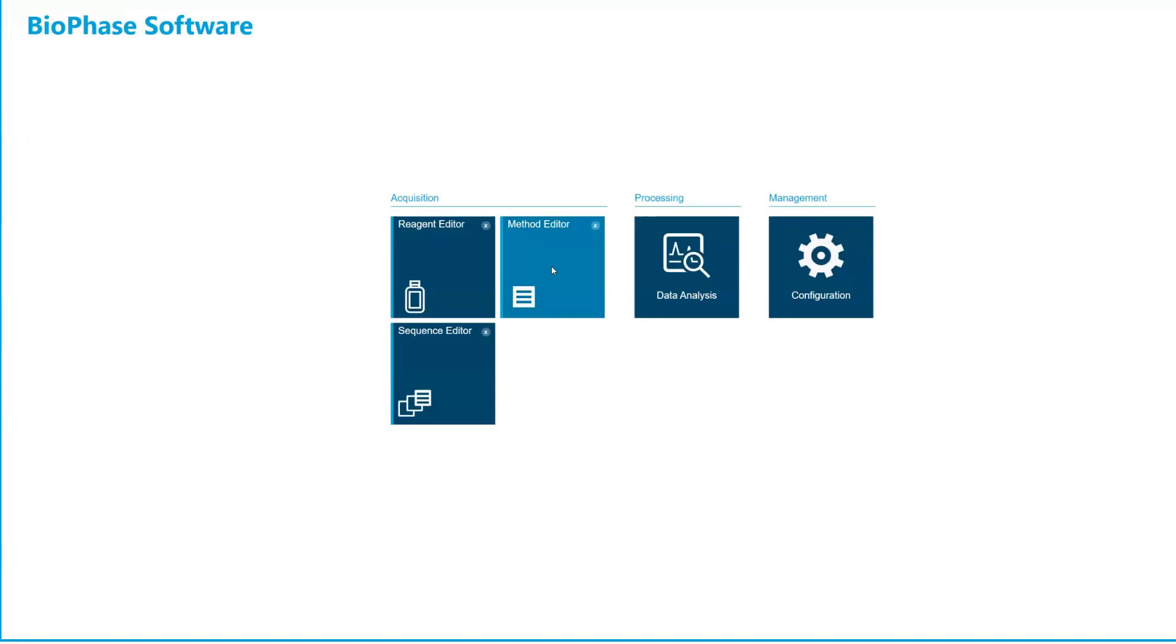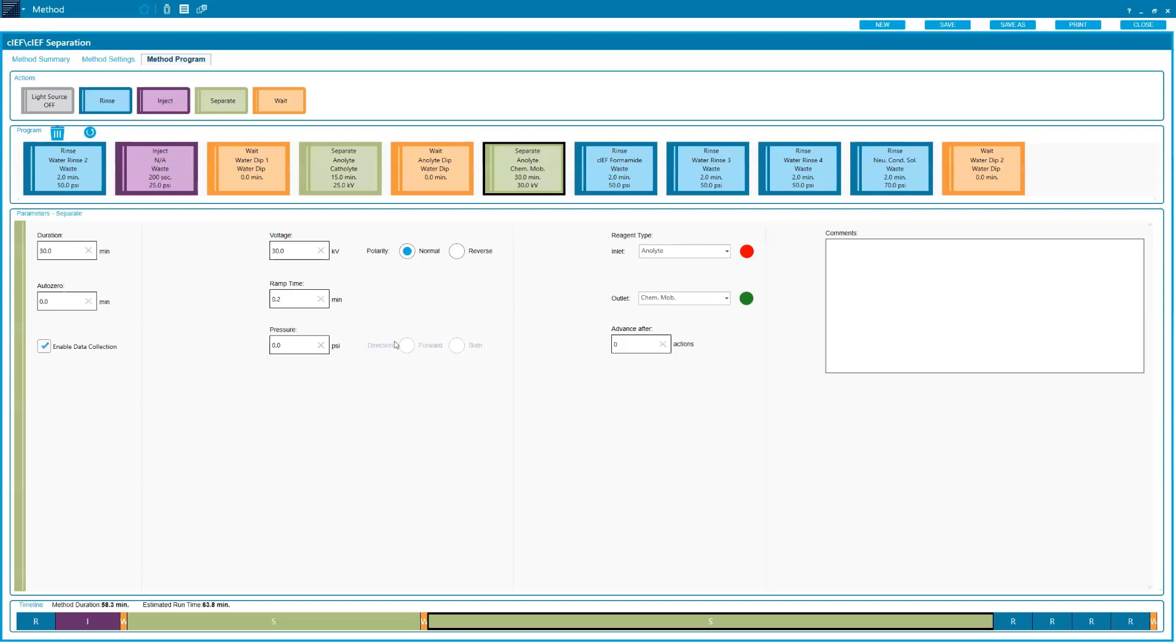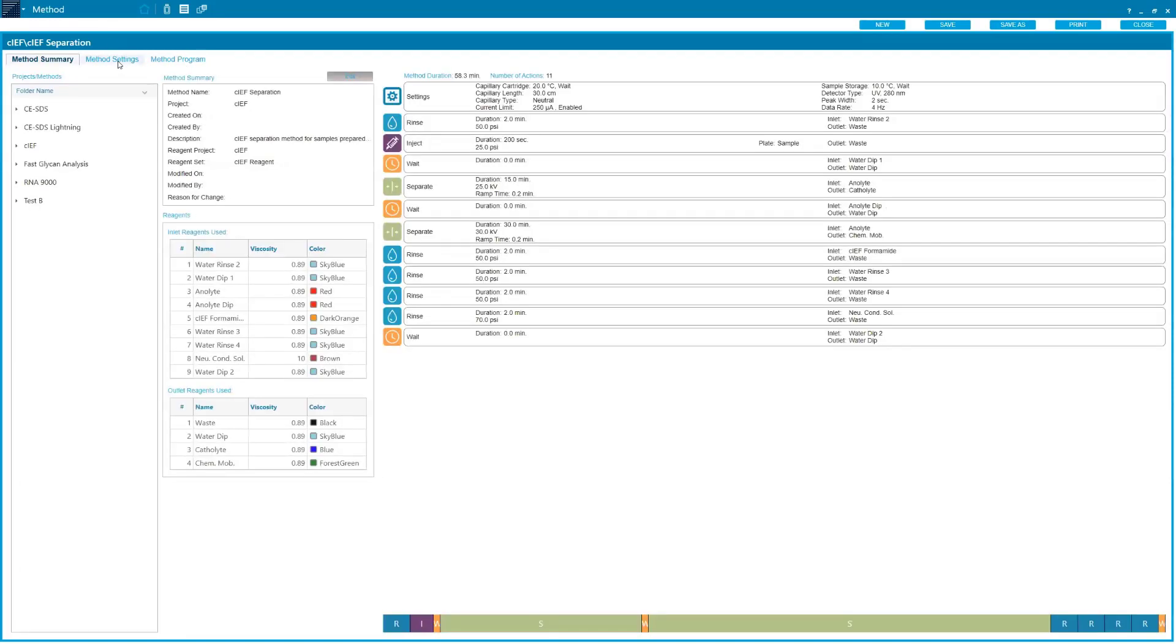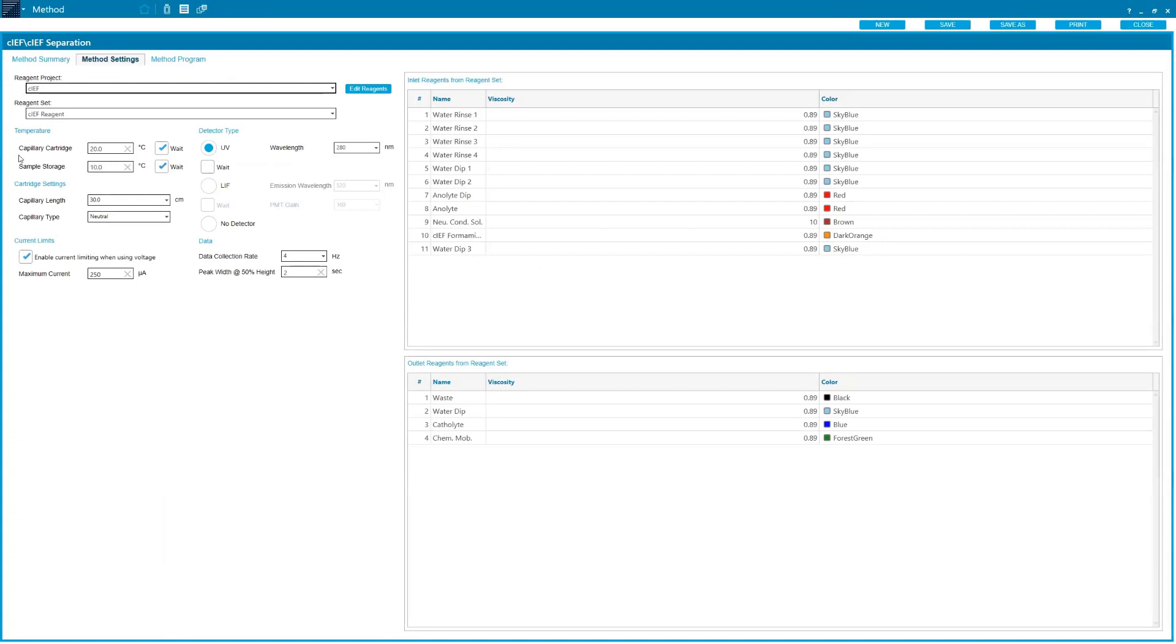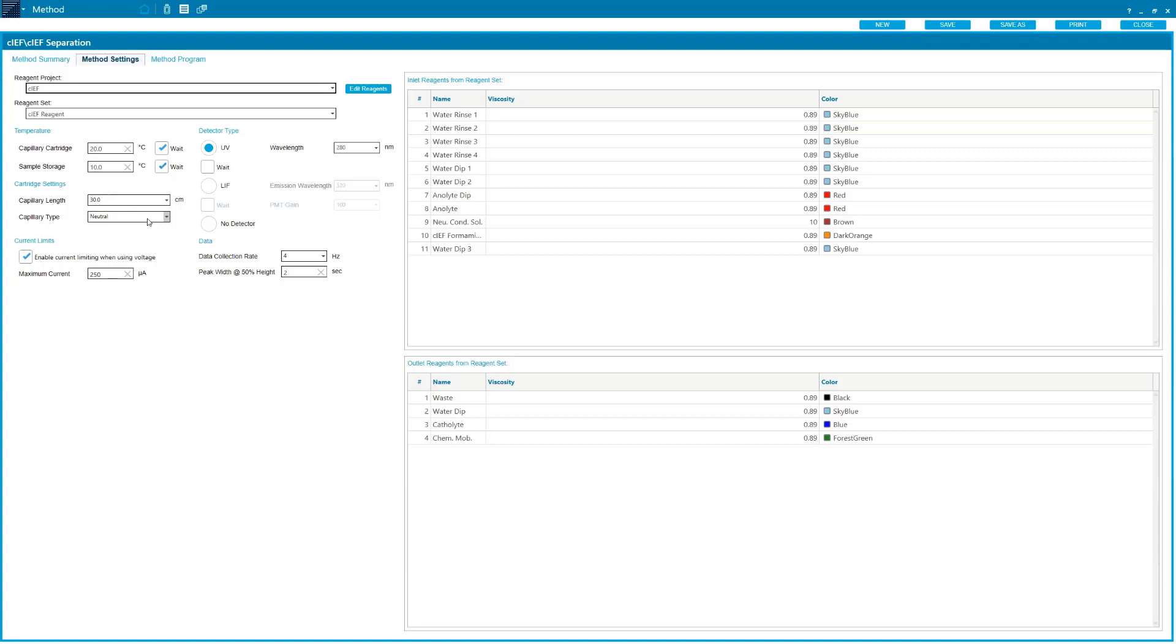Once we've loaded our reagents, we're going to go to our method editor. We'll start in our method settings. For PA100 Plus users and 32 Karat users or Empower users of PA100 Plus, we're used to this screen where we set our capillary cartridge temperature, sample storage temperature, detector type, and some of the other data collection settings. Some of the things that are new and unique are we can set the capillary type. As I mentioned, the software is going to know through that RFID chip if you've loaded the wrong capillary, which I've done one time, and I wasn't able to start my sequence, which was great because my results wouldn't have looked very good. It is a failsafe there in the software.